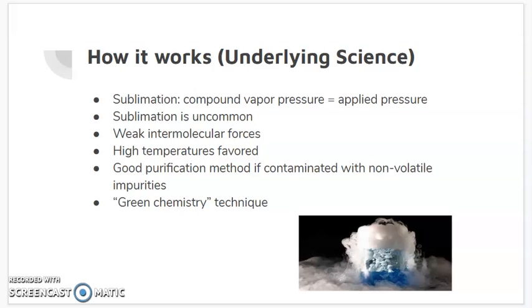How it works. Sublimation occurs when a compound's vapor pressure equals its applied pressure. Sublimation is rather uncommon because most solids do not have an appreciable vapor pressure at temperatures that are easily accessible. However, solids that can undergo sublimation generally have weak intermolecular forces. Sublimation can also be a good purification method if a volatile solid is contaminated with non-volatile impurities.